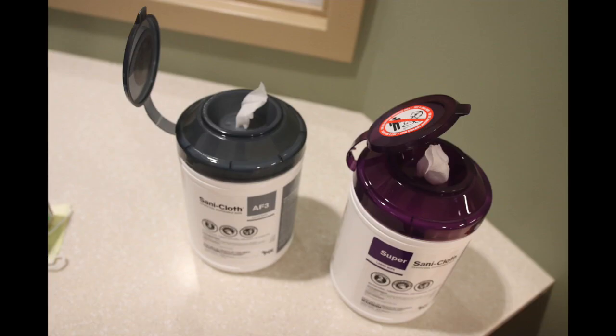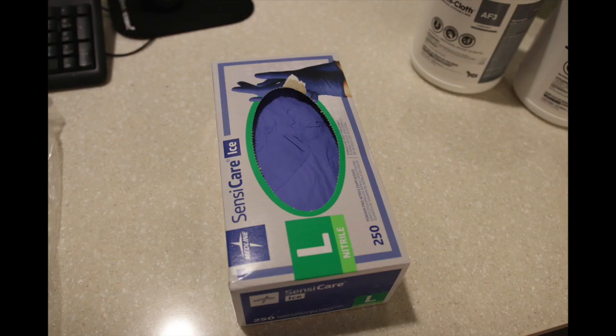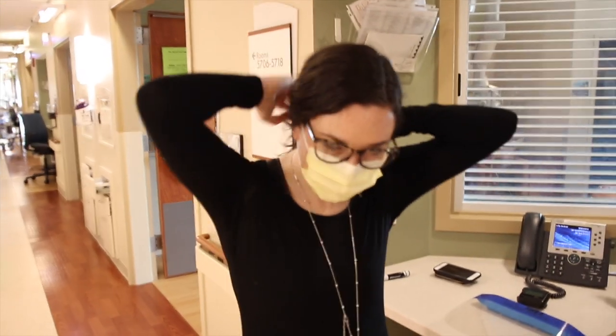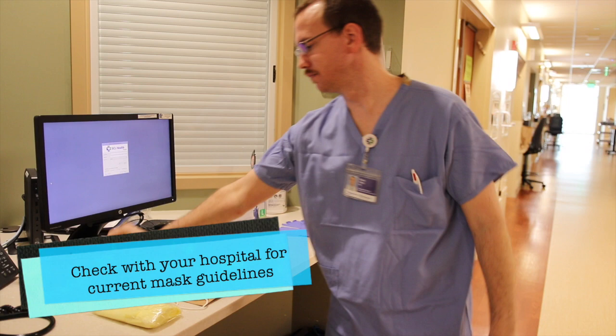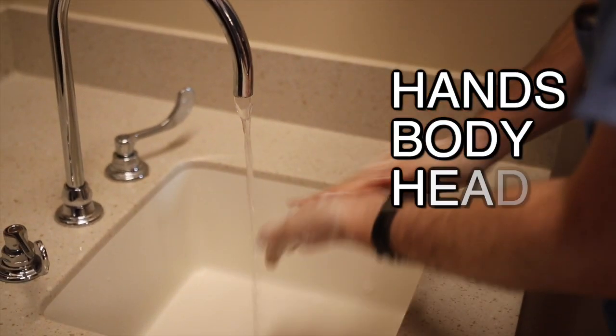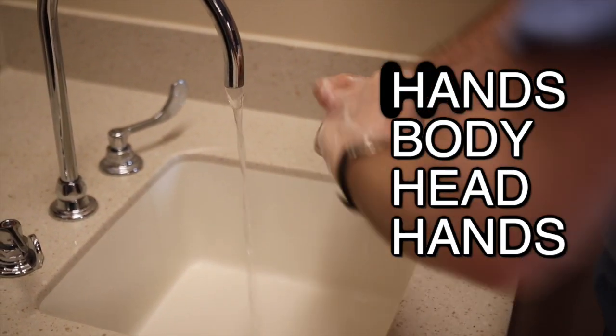Please also ensure that there are sanitizing wipes and additional gloves outside the room for when you exit. If you have long hair, please ensure that it is secure at this time. If you are currently wearing a mask, remove the mask at this time and set it aside. We will now start our hands, body, head, hands method of putting on equipment.